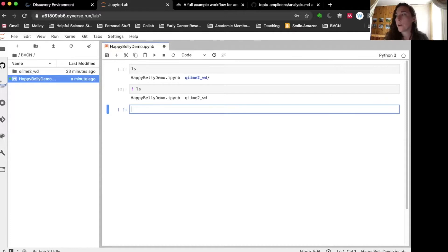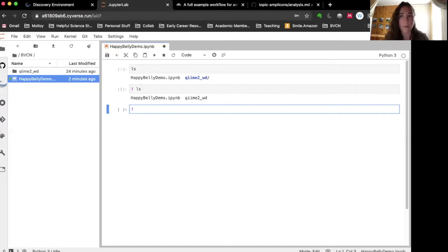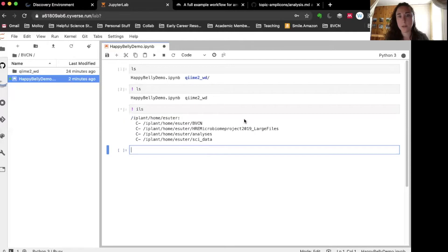In CyVerse you're working in two locations. We have this temporary environment where we're using our notebook, generating files, and using input data, but then we have a more permanent place called the data store. I connected to that using CyberDuck, and you want to make sure that you also have that initialized in this environment. To interact with files in that location I use something called iCommands, which also need to be implemented in bash using the exclamation point. Running 'ils' will show us the files that exist in my esuter folder on the data store.